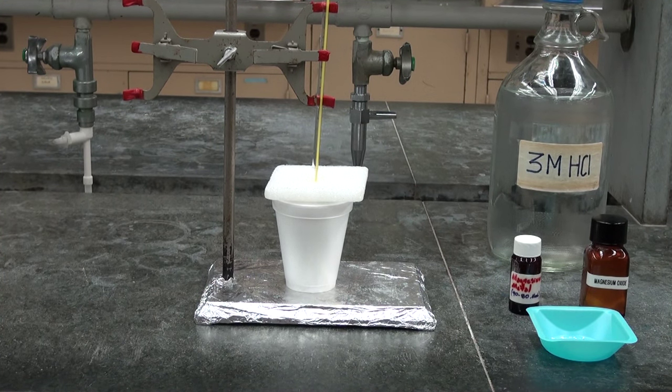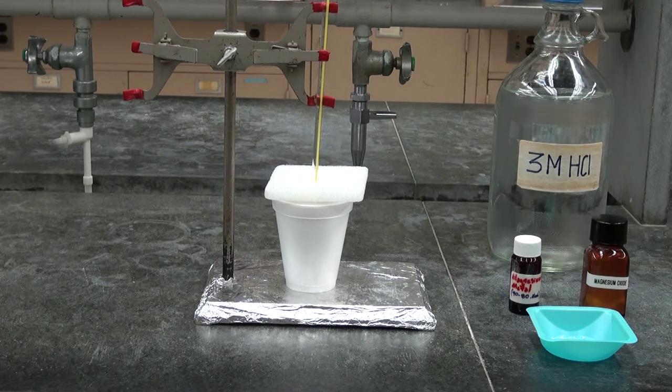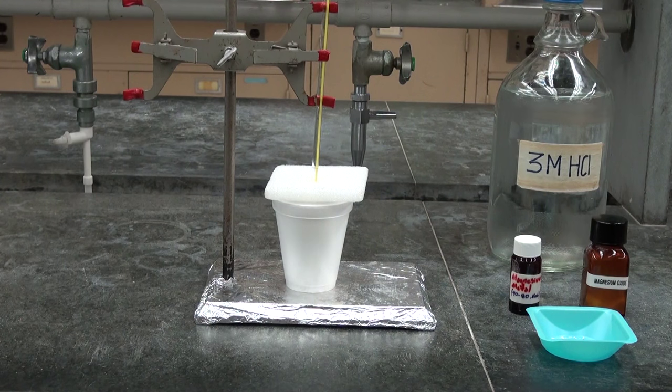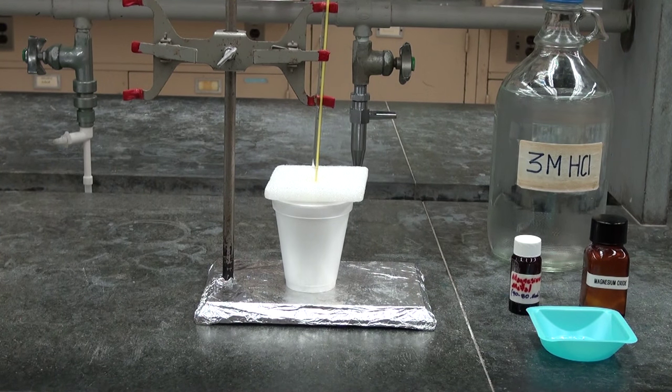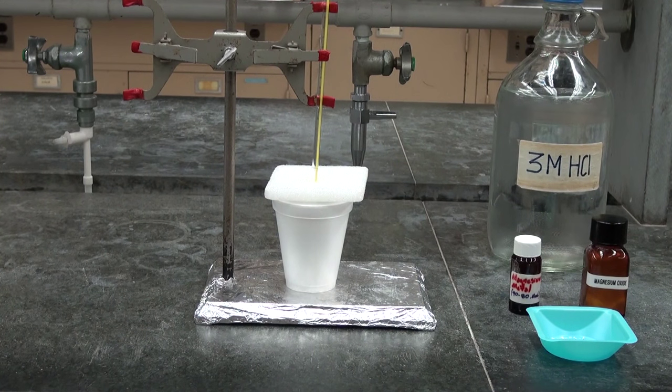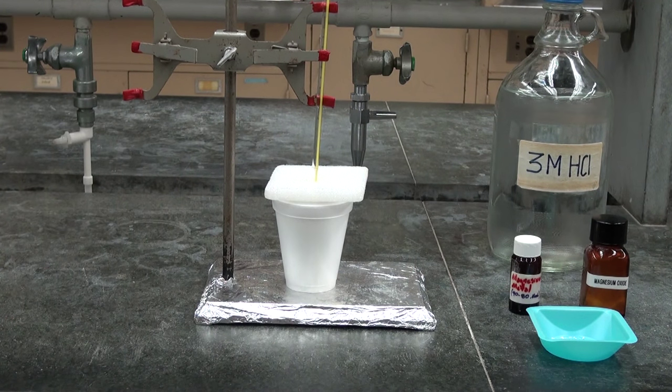We have previously measured the mass of the empty coffee cups, then added approximately 100 milliliters of hydrochloric acid and remeasured the mass. The difference of those two measurements gives us the mass of the hydrochloric acid, and that can be done on a top loading balance.